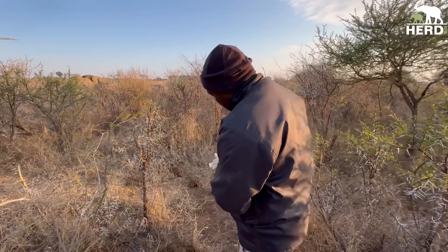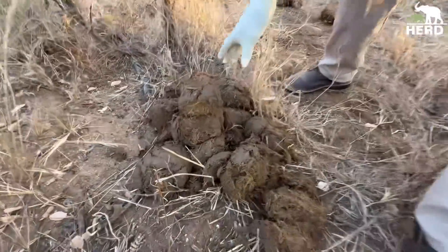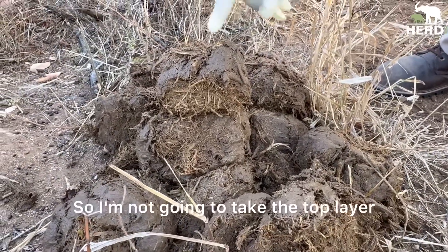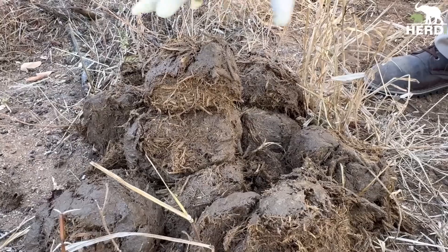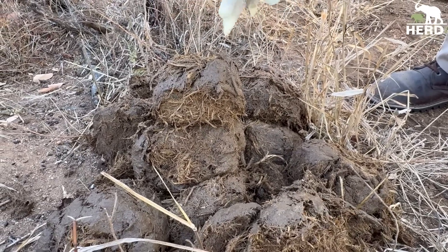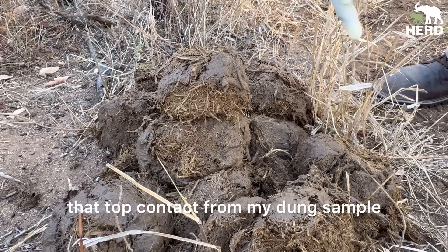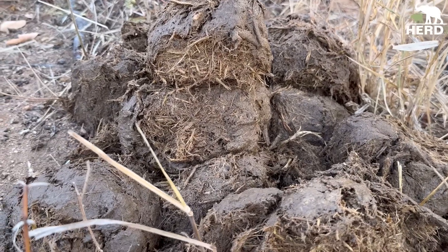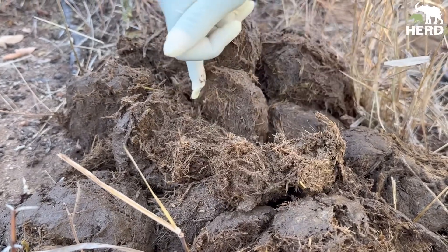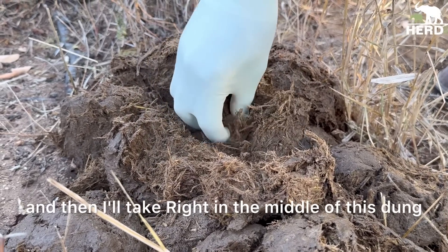On the dung here you can see it's Summer Pony's dung. I'm not going to take the top layer because there are a lot of flies and wind blowing sand, so we don't need that top contact in the dung sample. I'm going to use the dung from the bottom, right in the middle of the pile.